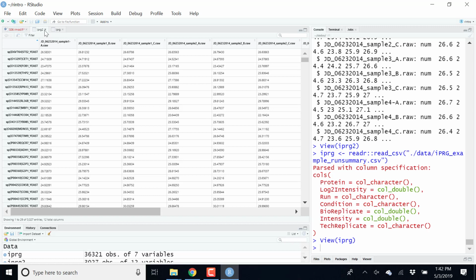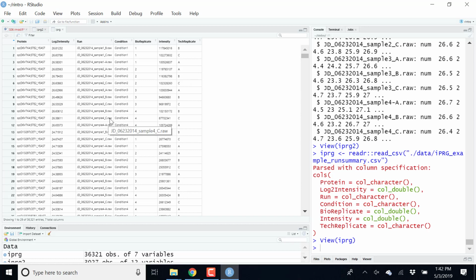Okay. This is immediately obvious with this data structure, but not at all here. Actually, if we were missing this line, because there was no intensity recorded for that sample and that protein, we might not have that line at all. Okay, so we might not have any missing values in this table, and yet miss some intensities for some samples and some proteins. Yes, that's a question.